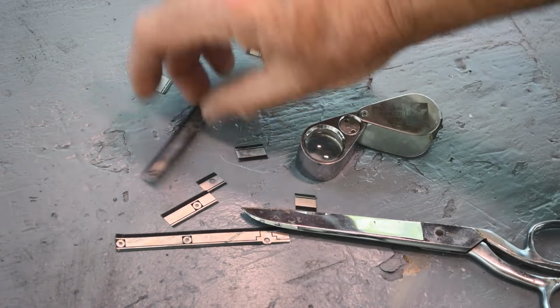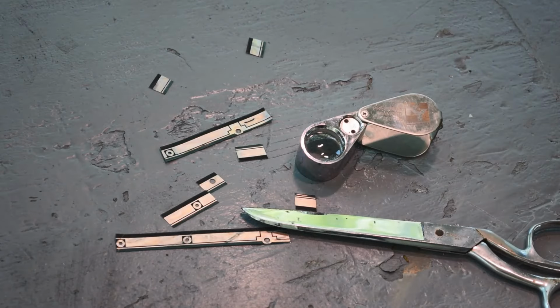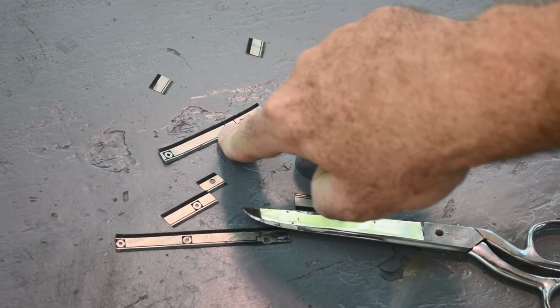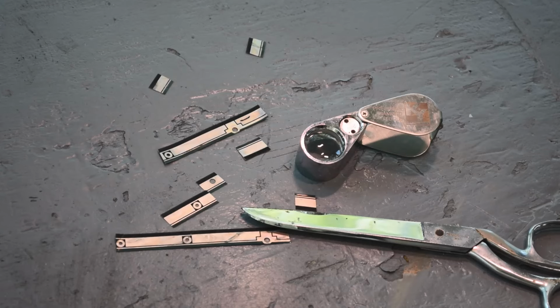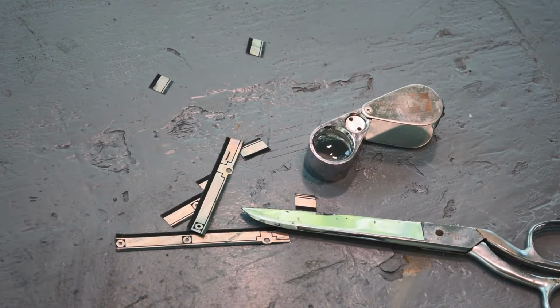This silvery metal, whatever it is, is plated on top of copper. And our initial reaction was removing this silvery metal, which looks like it is nickel. And then we've gotten down to the copper underneath, and the copper is going into solution now, and that's why the liquid has gone from green to blue. So yeah, I can see copper in there with my loupe on the edge when I cut it. So, okay, that makes sense.